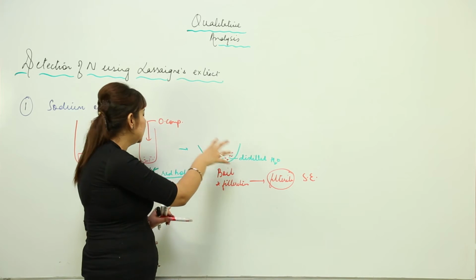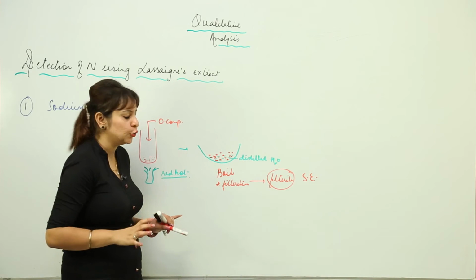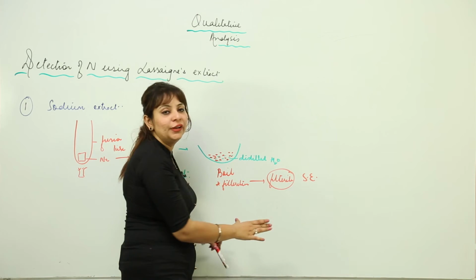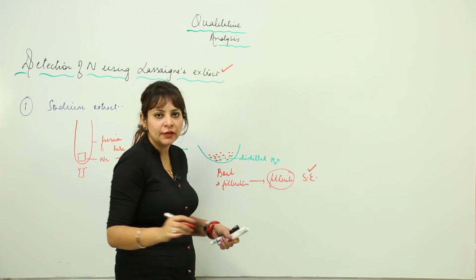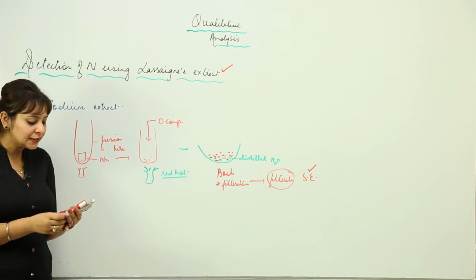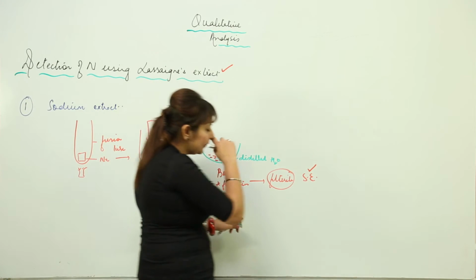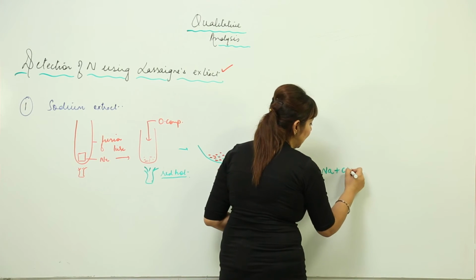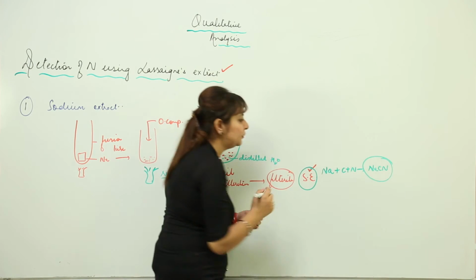So it will contain all the substances which are present along with the pieces of this fusion tube. Then we boil it and filter it, and the filtrate we get is called the Lassaigne's extract or the sodium extract. You can call it by either name. Now we are going to use the sodium extract to detect nitrogen. The sodium extract contains sodium plus the organic compound, so it is basically sodium cyanide. This is what is there in the filtrate.